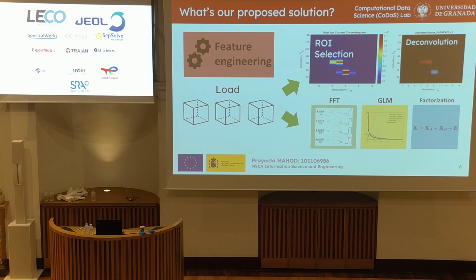I don't like the time domain analysis. I'm very biased. I'm going to tell you this right away, because this looks more simple, more parsimonious on top. But with the region of interest selection, it's hard. With the deconvolution, it's hard. You have to pick numbers of components, thresholds, all kinds of ugly things that I don't think are beautiful. All of these things on the bottom are automatic, parameter-free.